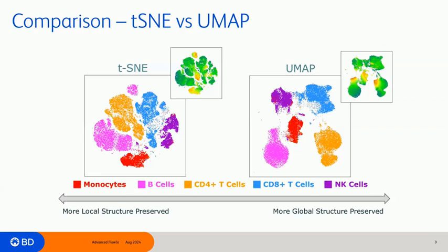It's also computationally intensive. Especially with large data sets, the processing time can be long. The algorithm requires significant memory, and that can be a bottleneck if you're doing a large analysis. It's sensitive to parameters. Results of t-SNE can be sensitive to how you input or tune parameters like learning rate and perplexity. So finding the optimal settings might require some different iterations, or asking other experts that might have used it in the past.